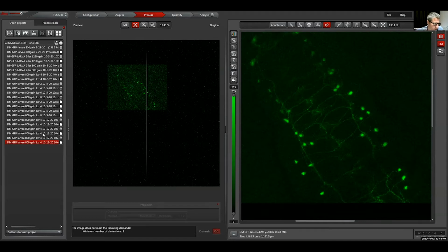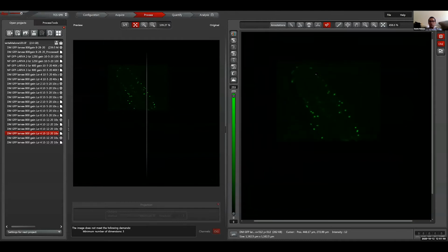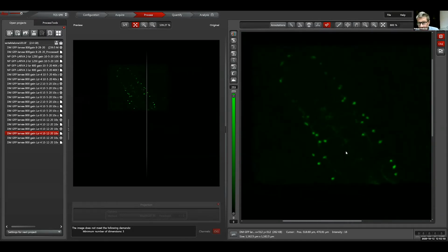If I go to the last one you did, which was the process of the 512, and I zoom in, what happens? Yeah, I was going to say I remember the 512 being a lot darker. So this sucks, right? Yeah. It looks out of focus. It's just not very good. So that's a legitimate result: we got increased resolution and a better picture by maximizing the pixels, but still using the 10x.